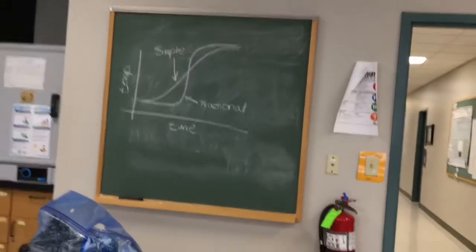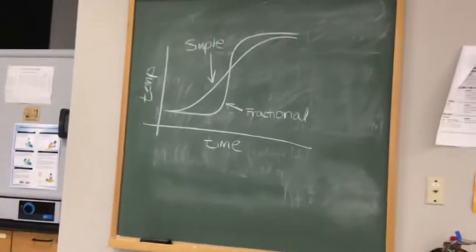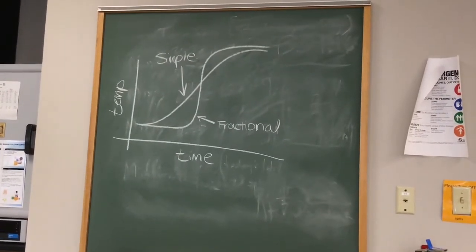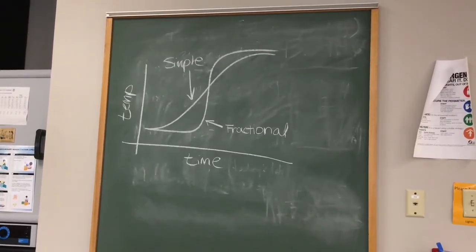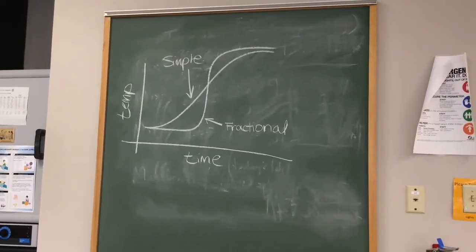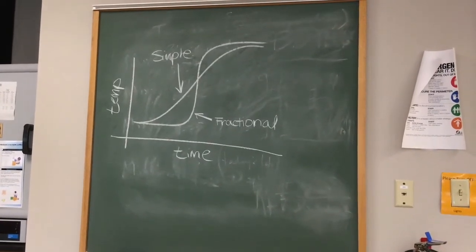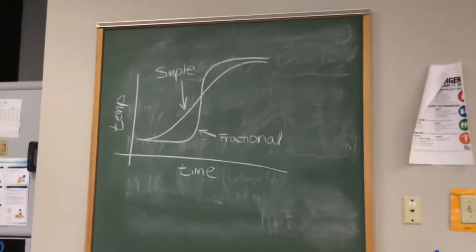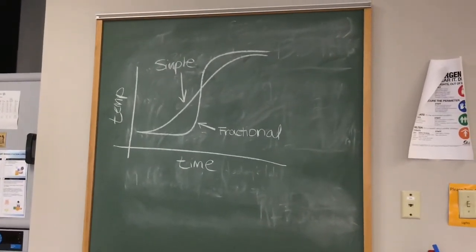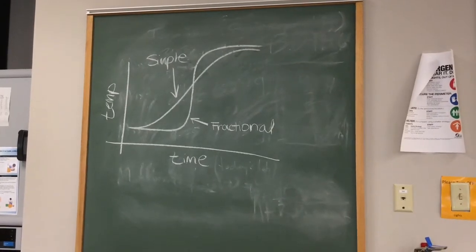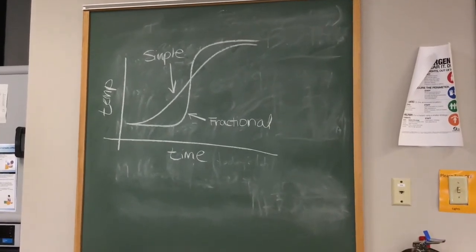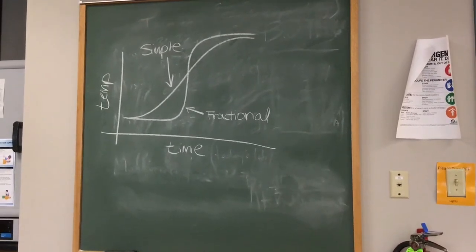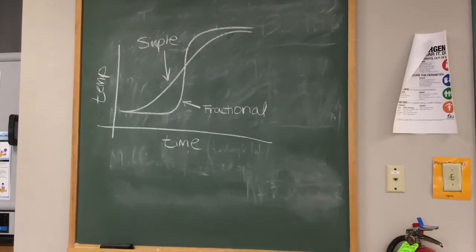When you do so, you're going to get a plot of points that looks something like this. You're not taking as many points as necessary so it's not going to be as clean but you need to keep an eye on the temperature of the apparatus because that will indicate where you are in the distillation. As the fractional gets closer and closer to the point, you see that it maintains a constant temperature and then quickly turns and almost makes it vertical before it equalizes again. If you remember from general chemistry, if you are heating up a solvent that's not boiling, you're going to show an increase in temperature but once you reach the point of a phase transition, all of the heat will then be supplied to perform the phase transition. And so you will have no difference in temperature. That's why it's flattened at the beginning. You're boiling off the solvent and all the heat is going into that phase transition.